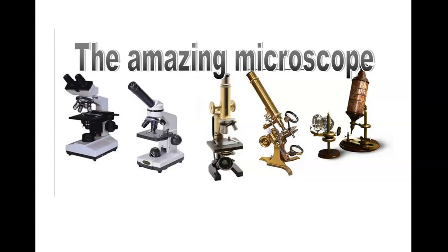Microscopes are more complex today. We do have binocular microscopes, like the one all the way to the left, and the stage does move side to side, horizontal, left to right, by some moving devices. We don't have microscopes that are that complex. Our microscope just simply has a stage, and we move the slide around on the stage using our hand. Okay? So the microscope we will be using is similar to the second one from the left.